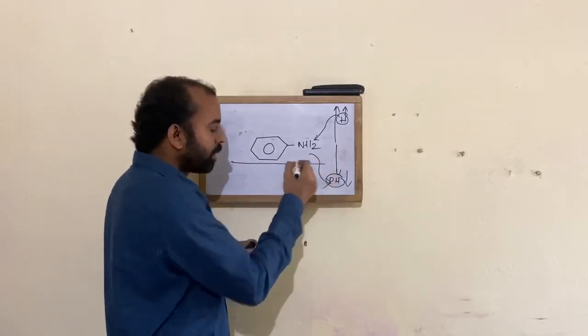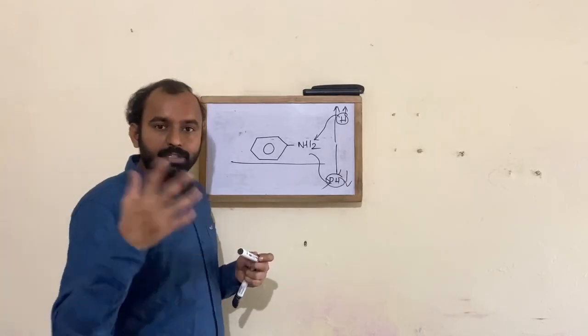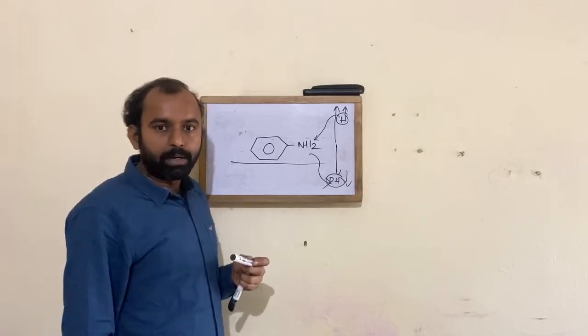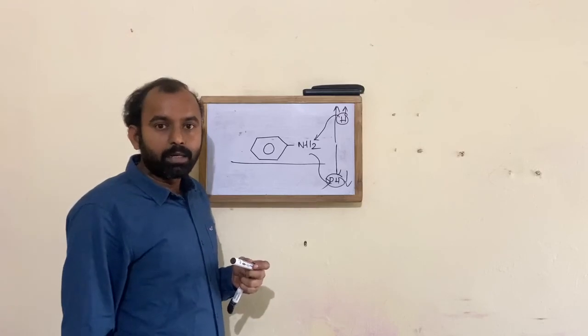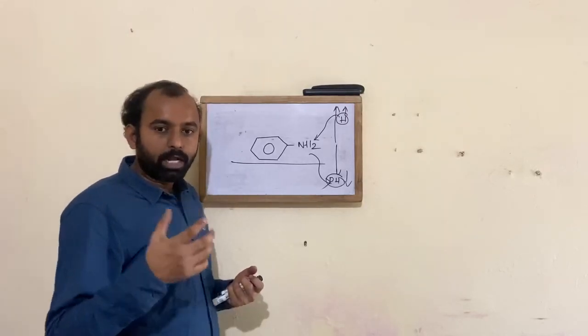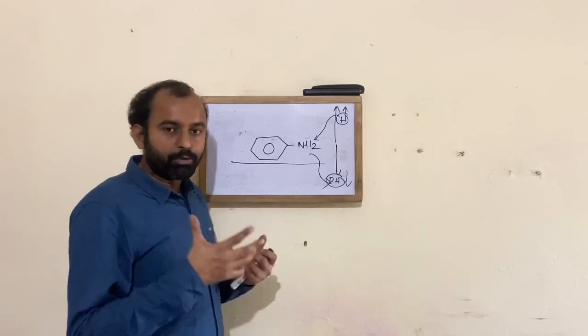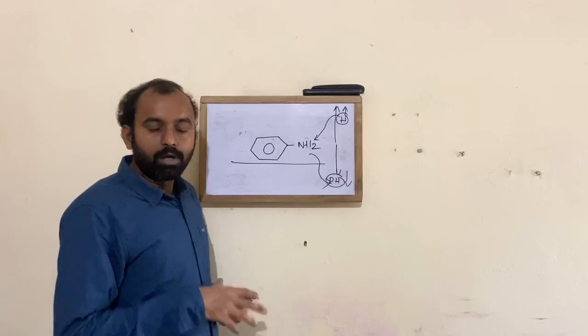This fluorescence is also pH dependent, temperature dependent, viscosity dependent, solvent dependent, and concentration dependent. You also need to know that the lower the concentration, the more reproducible the results. This is the fundamental information of fluorescence.